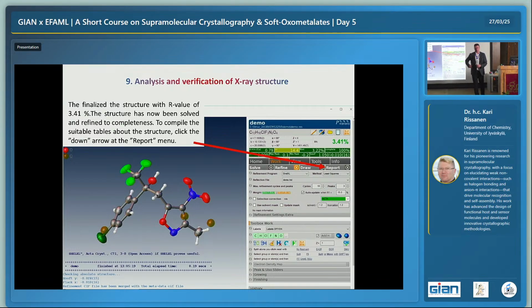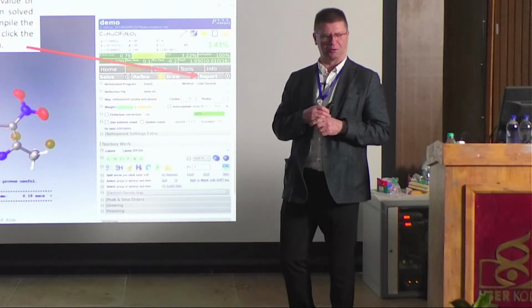Now it's the final day. After 4 long days, there will be a final day, closing everything. So we have now learned the basic theory, really basic theory on single crystal X-ray diffraction, what happens with all these things. We have already had an exam. We've been absolutely fine. Some questions there related to the work we have been doing here.